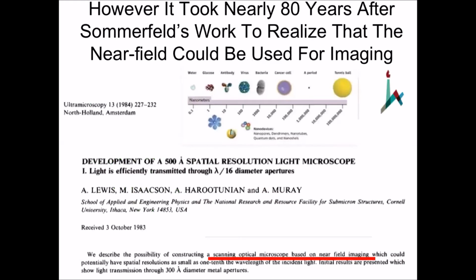And the first paper that did this was a paper that I published in 1984, where we connected, as you see in the abstract here, to the near-field imaging issue. That means that we were the first people to really understand that we could take Sommerfeld's idea of a radiating dipole and capture it in a methodology that gave us some hope to make a microscope out of it. It took nearly 80 years for someone to realize that what Sommerfeld did could be applied to imaging.